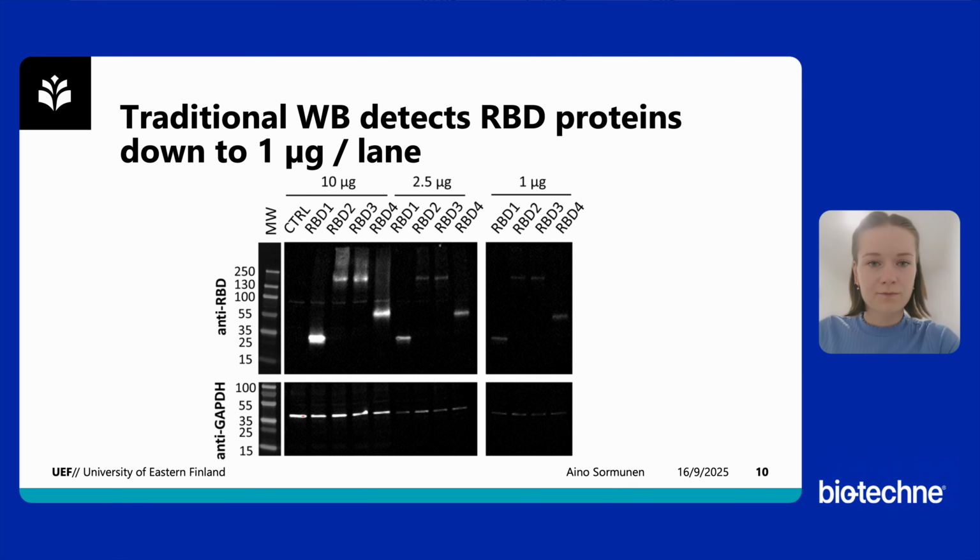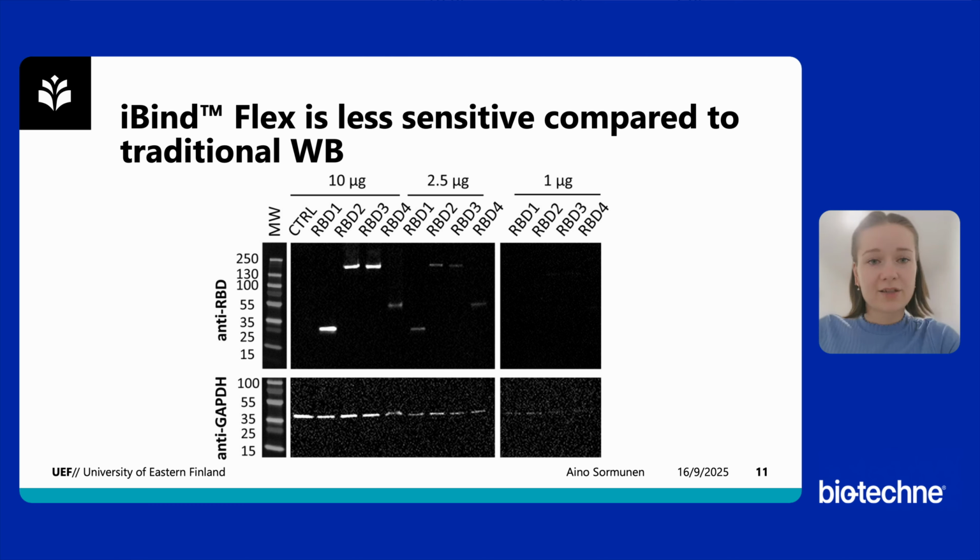Then for the iBind. While the iBind Flex showed RBD bands of good quality in the lanes loaded with 10 and 2.5 micrograms of total protein, the bands were largely undetected at 1 microgram. And this is even though we used the same exposure conditions or even increased the exposure times from a few seconds up to over 60 seconds.